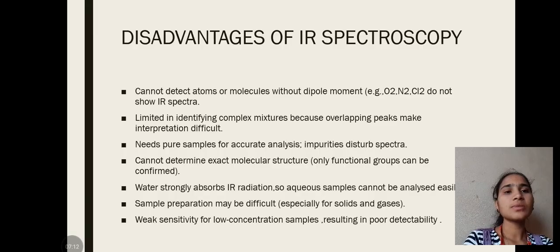Water strongly absorbs IR radiation, so aqueous samples cannot be analyzed easily using IR spectroscopy. Sample preparation may be difficult, especially for solids and gases. There is weak sensitivity for low concentration samples, resulting in poor detectability.